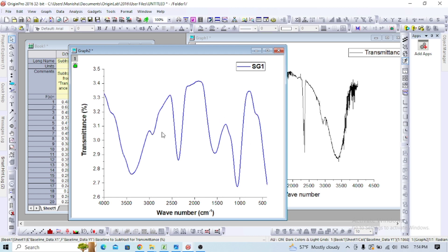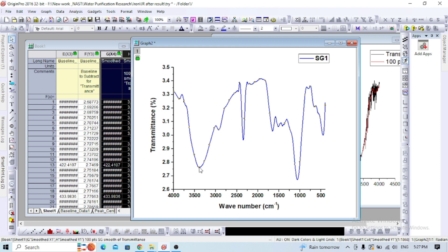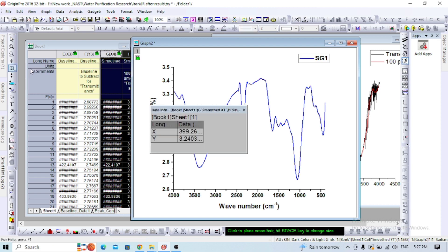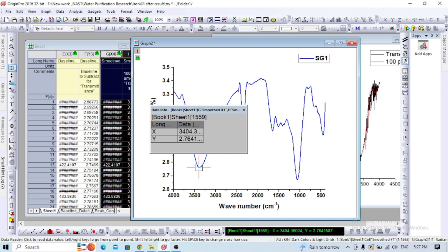This is your final data. For peak analysis, click the graph and select data reader from this section. Now you'll see the x value is 3404.